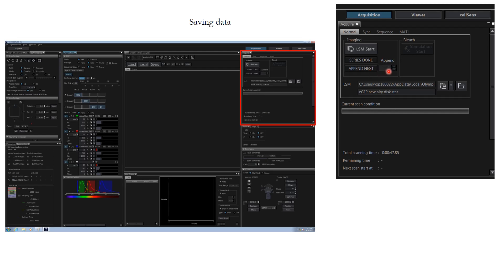In order to save the data, the data is automatically saved in the destination folder here. Right now it's C drive. Click on this option and make sure that you are never ever storing any data on C drive. If you store data on C drive, it's small, it will fill up really quick, and the computer will crash. Number two, if the computer crash happens, then your data is also lost.